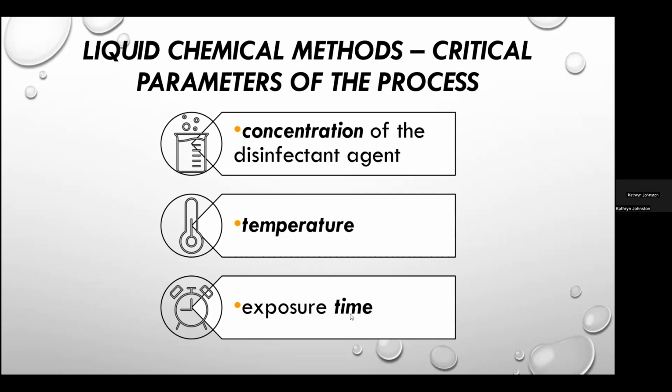When you talk about the concentration, the dilution can change over time, because when you pre-clean something and then put it in the disinfecting agent, there's carryover water. So over time, you could have a weakening of the concentration.